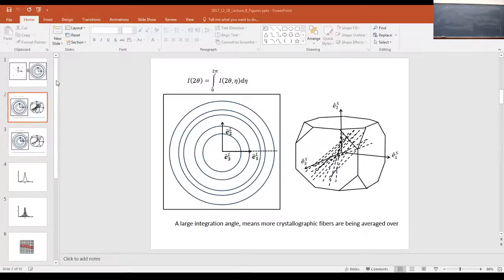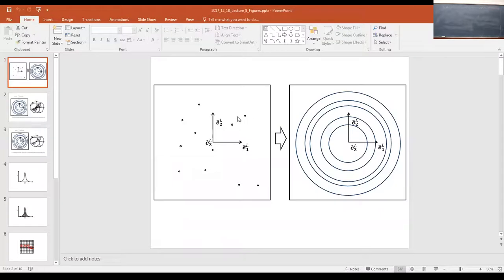So just as an example, the previous data we were talking about in the far field, we had individual diffraction peaks. We were able to associate these diffraction peaks with crystal orientations that were present. And then in lecture 7, we talked about how we could get information like the center of mass, the orientation, and the lattice strain tensor from the individual grains or crystal orientations that were present. In a fine-grained specimen, all the diffraction peaks start to overlap, and we get continuous Debye rings on the detector. We talked about this in lecture 4 of this course.